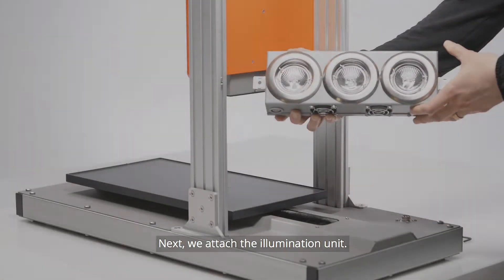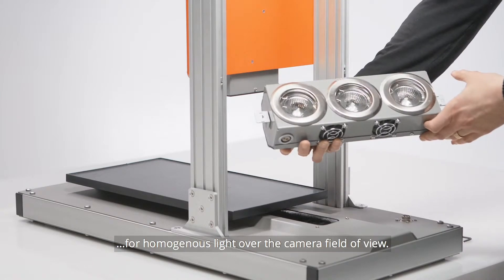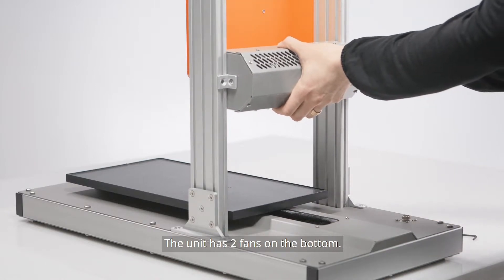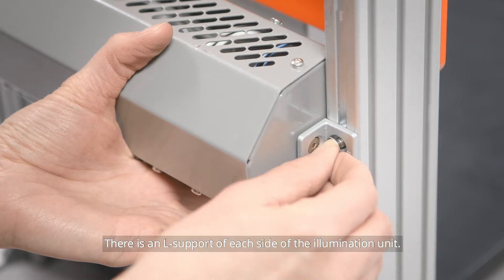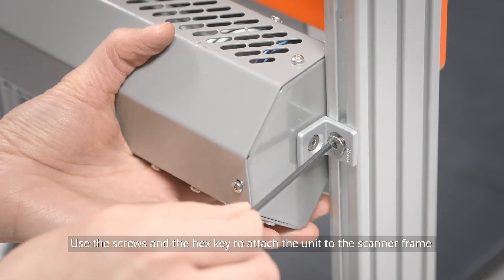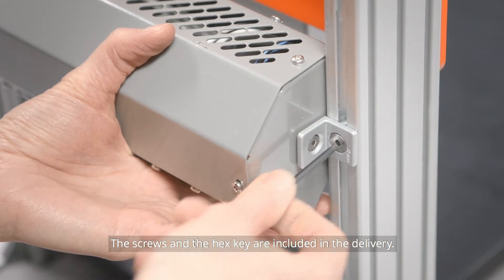Next, we attach the illumination unit. It has three halogen lamps that provide homogenous illumination over the camera field of view. The unit has two fans on the bottom. There is an L-support on each side of the illumination unit. Use the screws with a compatible hex key to attach the unit to the scanner frame. The screws and the key are included in the delivery.